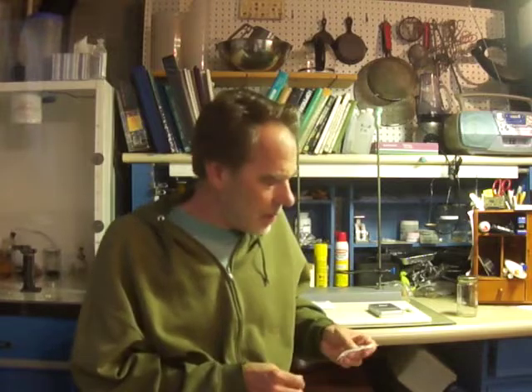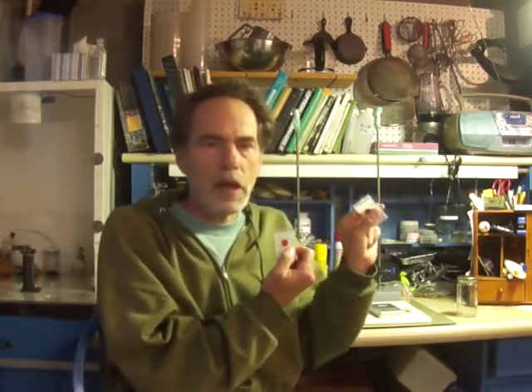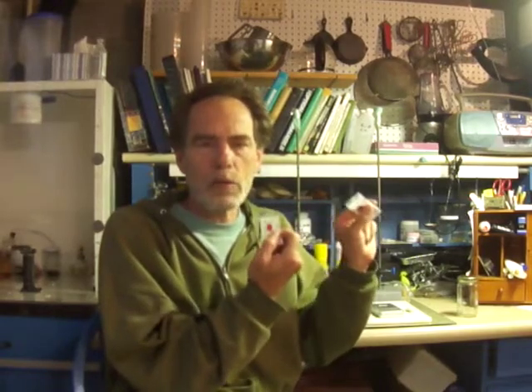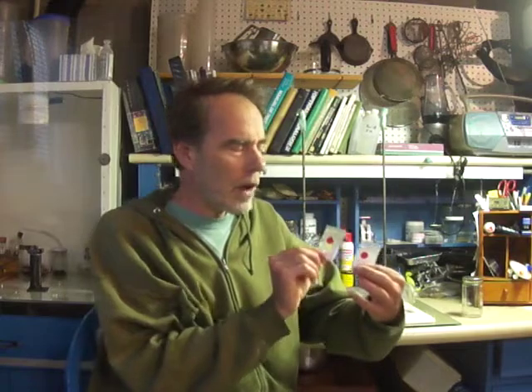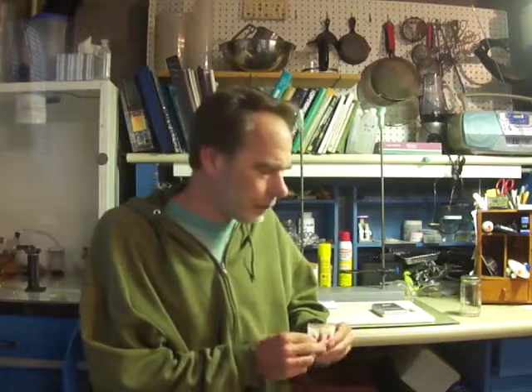He actually sent me a couple of samples here with very little information, so I'm kind of stuck going from square one and working through it. They're already powdered up and ready to go. The first one, he says, is a simple water-soluble salt to take a look at, and he says just analyze what the cation is, so that should be pretty simple. But still, I have no clue what it is other than that.